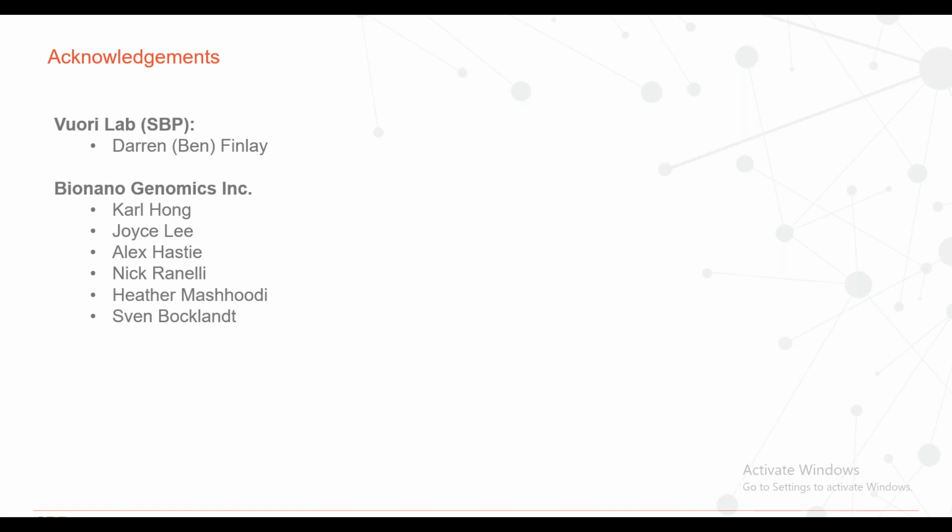So we have one question here in the box, and this could be answered by, I believe, Sven is probably the best one. How high is the cost per sequencing sample?